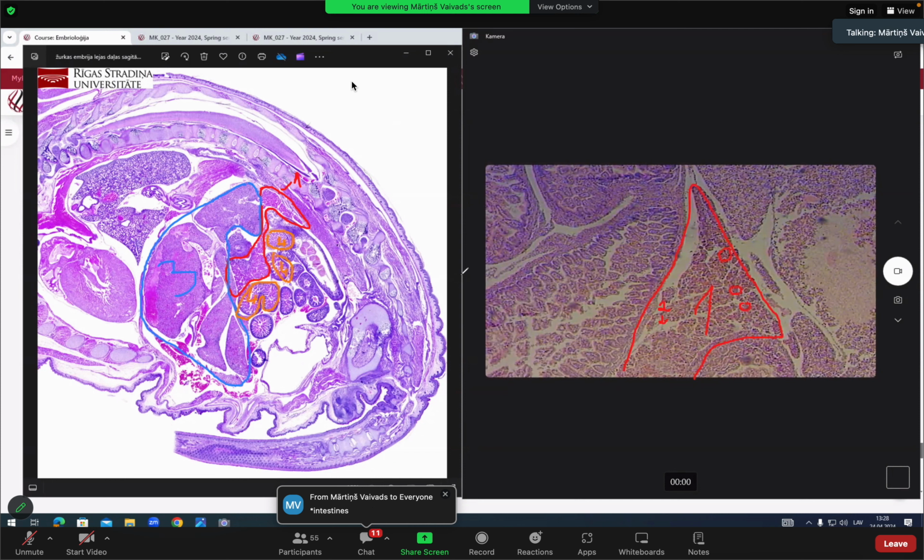Sorry for the typo. And the slime is the same thing. With number 4, you see intestines typically, and the liver typically is much, much bigger. So the liver tissue is here. There's some artifacts also, but the liver appears as a separate, larger organ. And so pancreas in the rat embryo, it's found between the liver and the intestines.